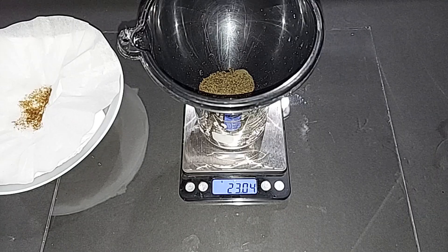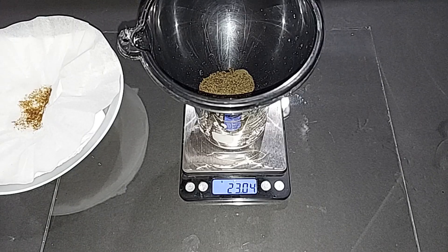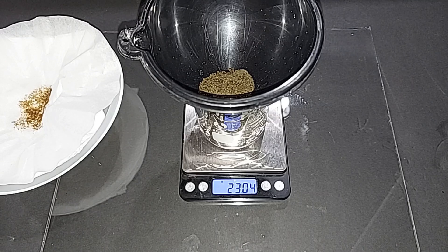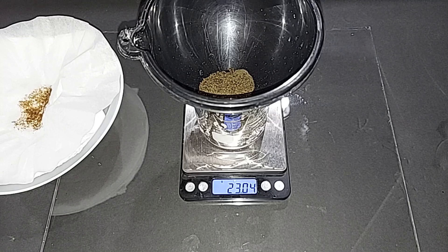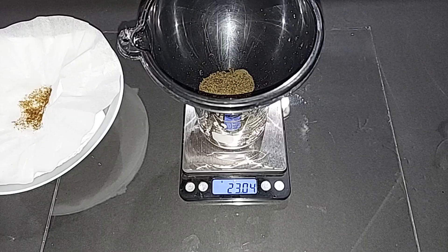I am going to run a couple of very basic tests on this next. Just as a quick comment, NerdRage has a video on making potassium permanganate near the end. He shows titration of potassium permanganate with hydrogen peroxide. That's really interesting, so you might want to give him a shout out. Next, I'm going to do those simple tests.